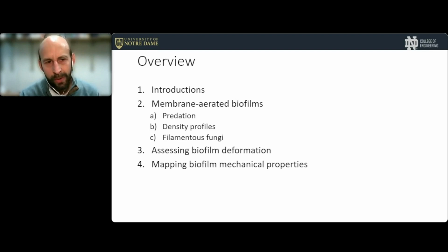So, as an overview, I'll start out with some introductions. I'll talk about one line of research, which addresses a special kind of biofilm in a process called membrane aerated biofilms. And then I'll talk about how we can use OCT to explore biofilm deformation and couple that with models, and also a special application where we can use OCT to map the mechanical properties of biofilms.